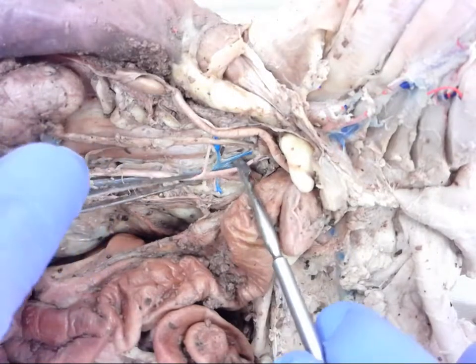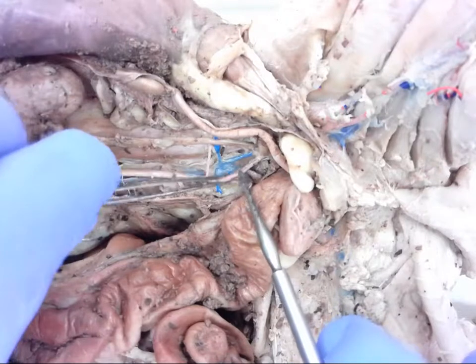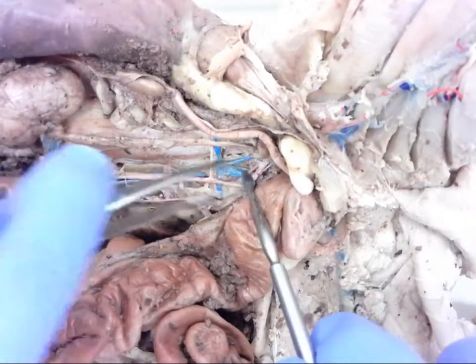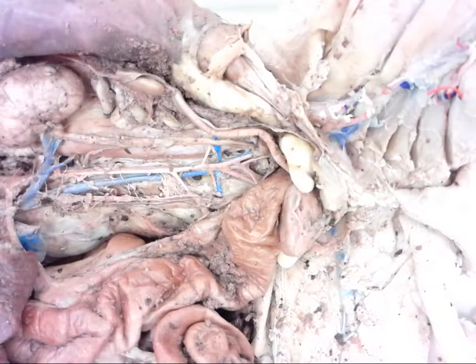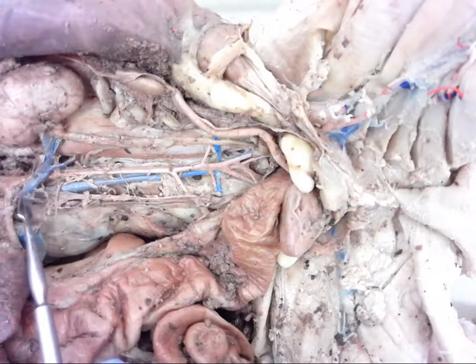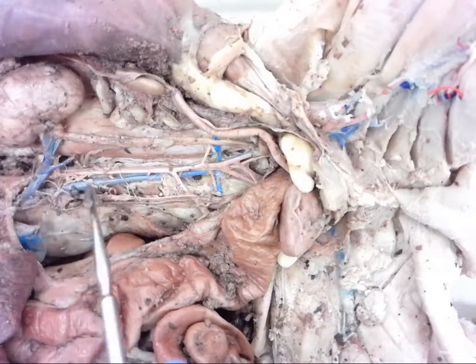Once these two combine, if I get that out of the way, you can actually see our branches here. Those two are going to combine to form the inferior vena cava. Now, if you look closely, you'll see that in the upper portion of the abdominal area, the inferior vena cava sits on top.